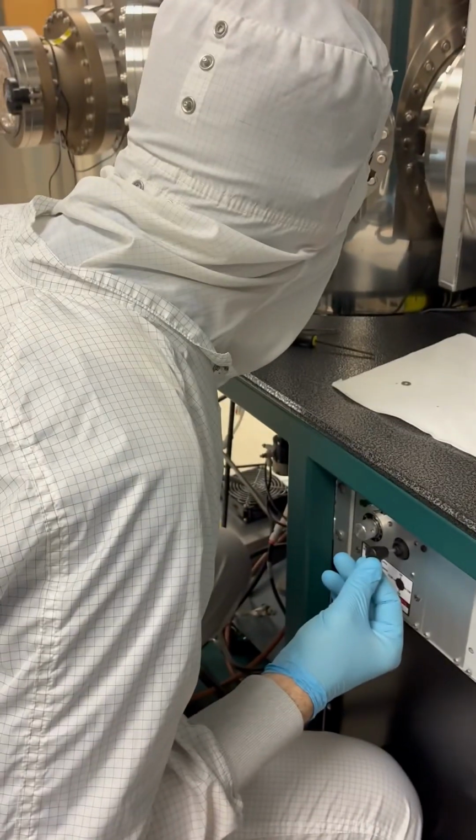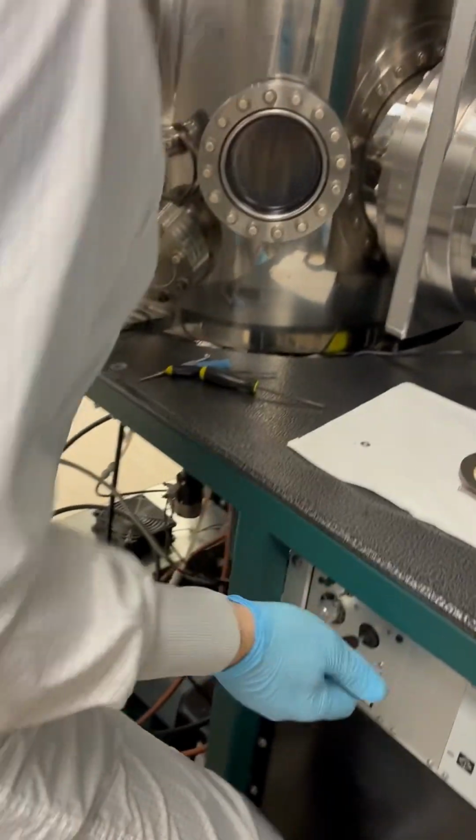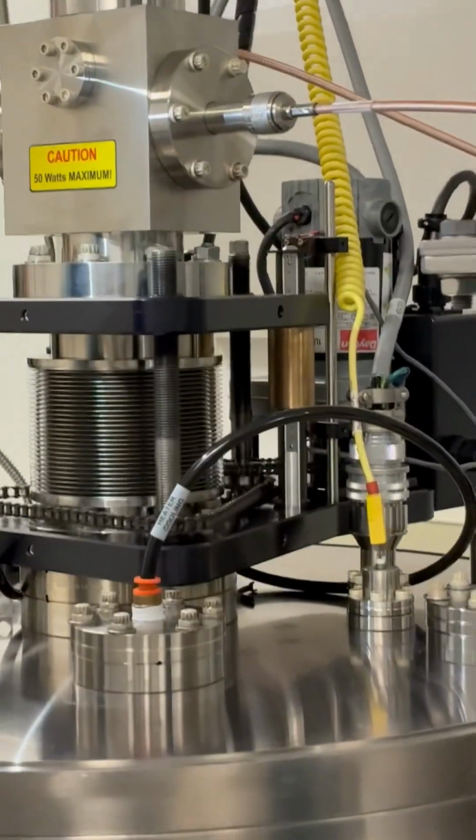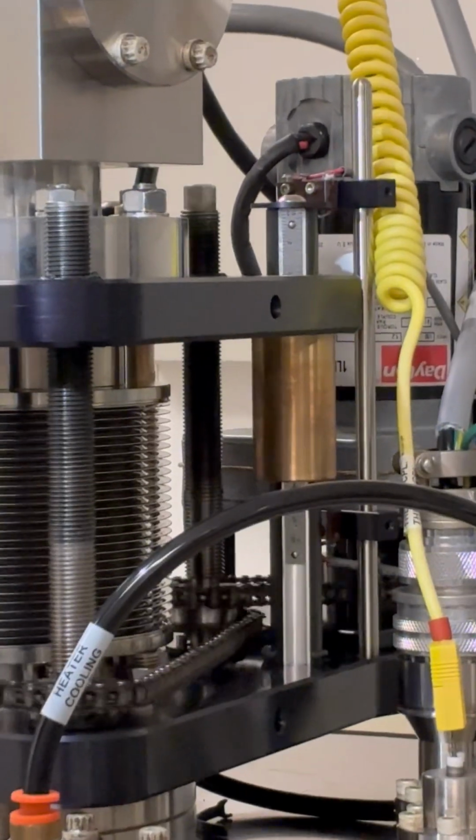Yep. So now I'm going to go all the way up to 20 millimeters. There we go.